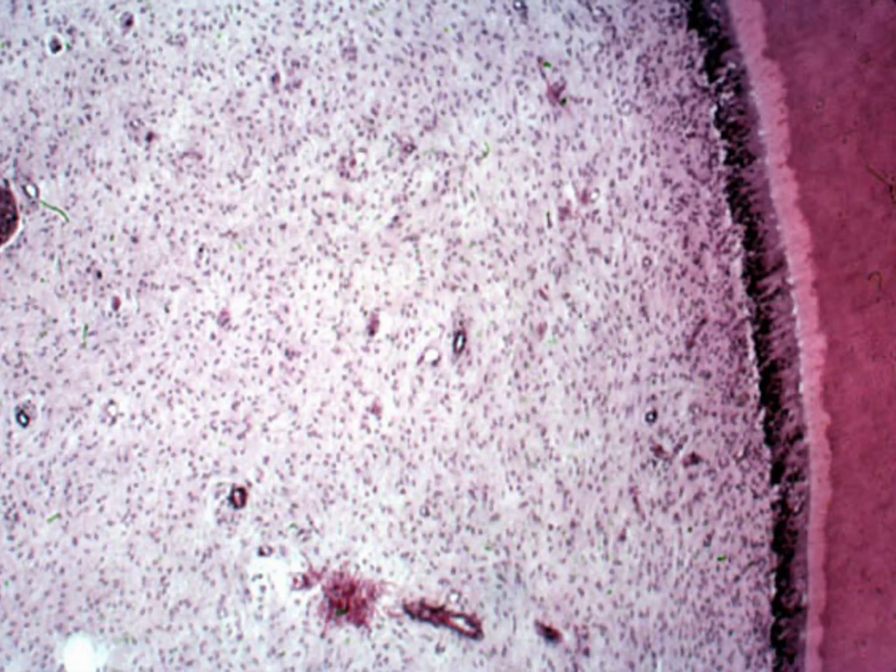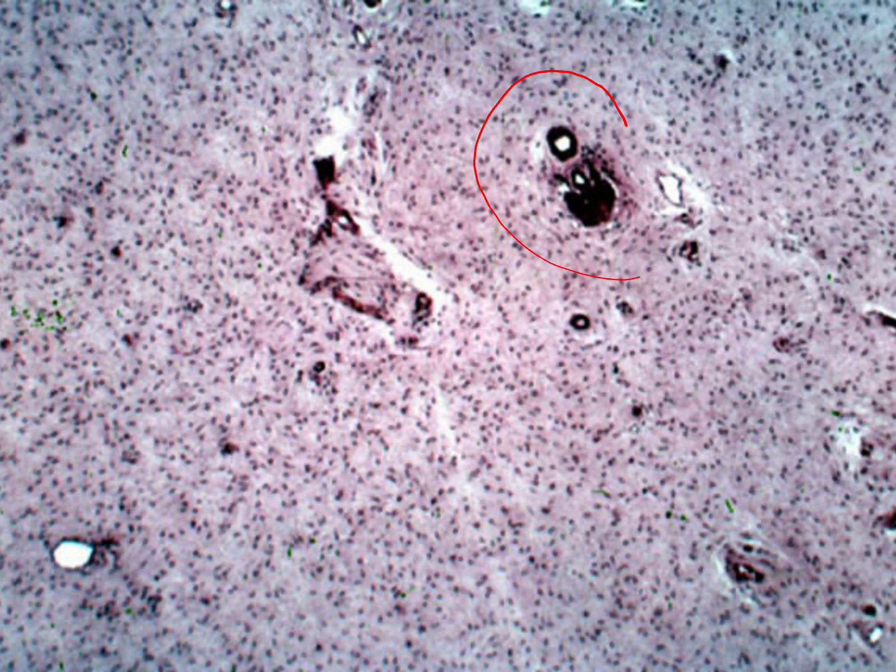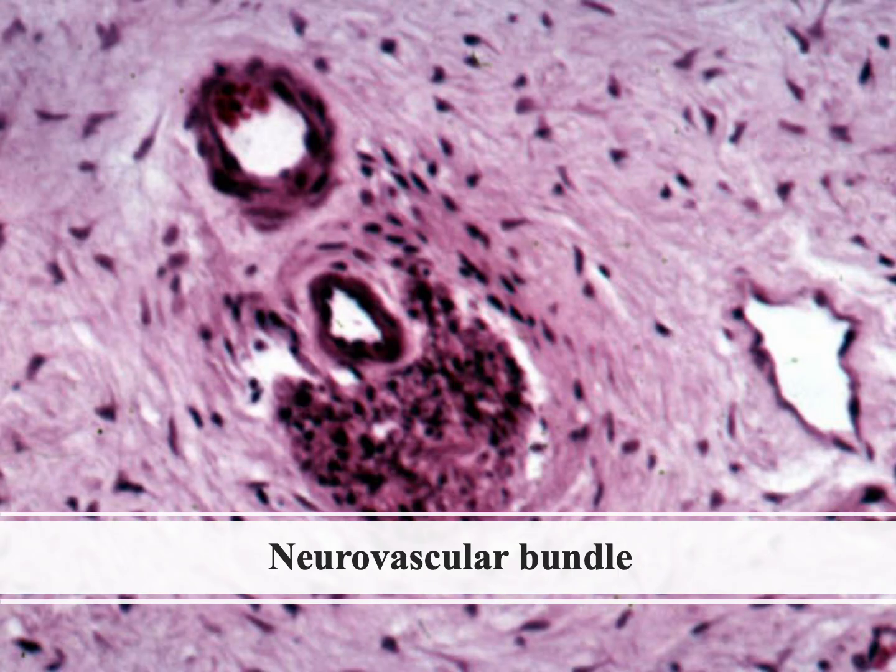It comes together, entering the root and branching afterwards. We just magnified this section in higher magnification. Remember this? This is the neurovascular bundle, the woven light and dark, full of cells view, showing the nerve bundle and the arteriole connected with it.